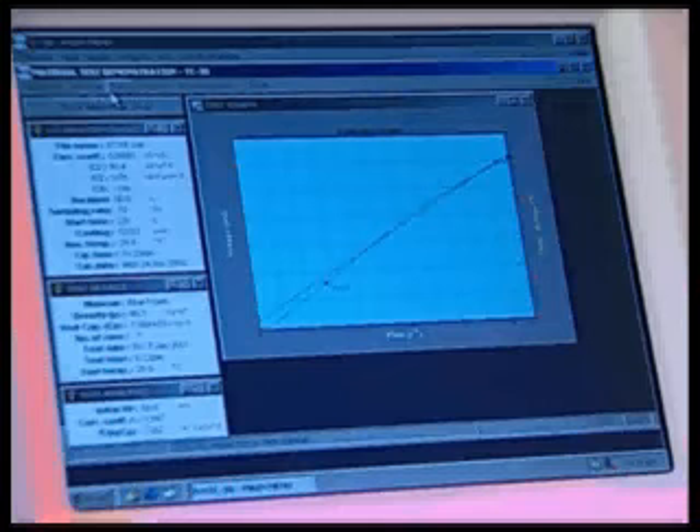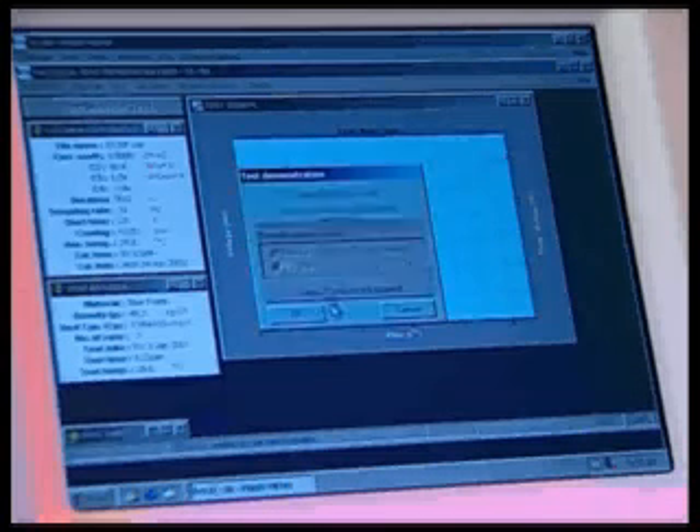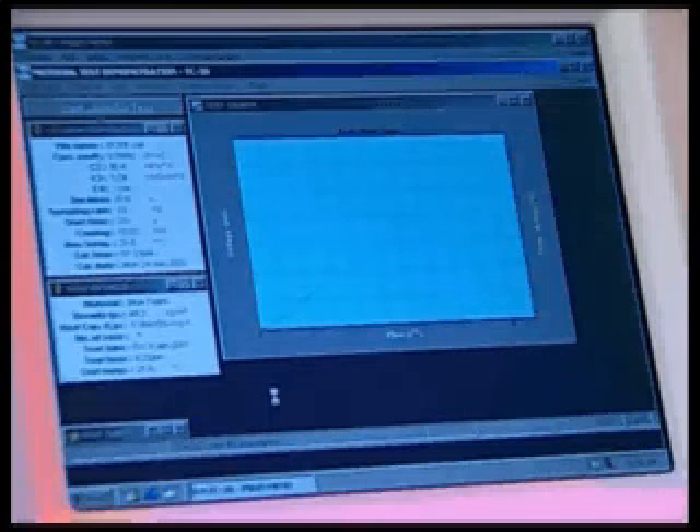At the heart of the TC30 is Mathis software. This user-friendly interface allows for easy system calibration, material testing, data management and reporting.